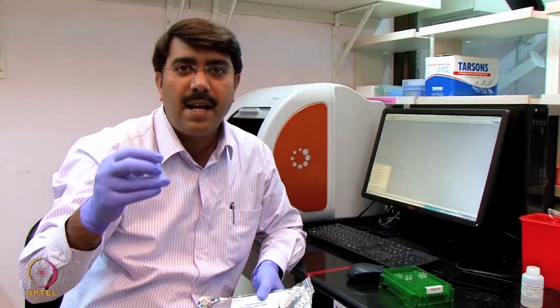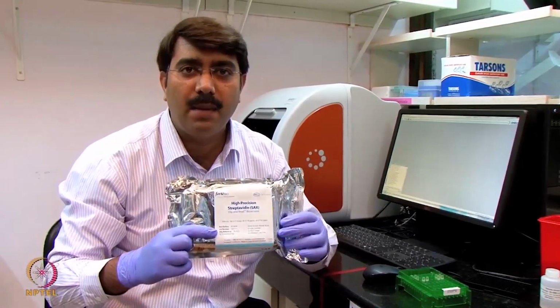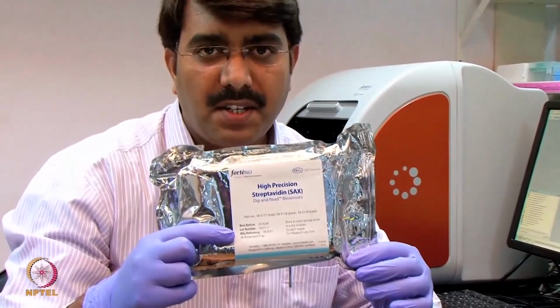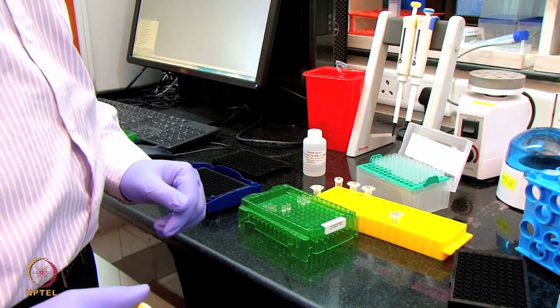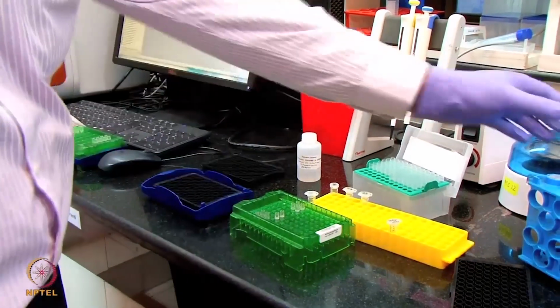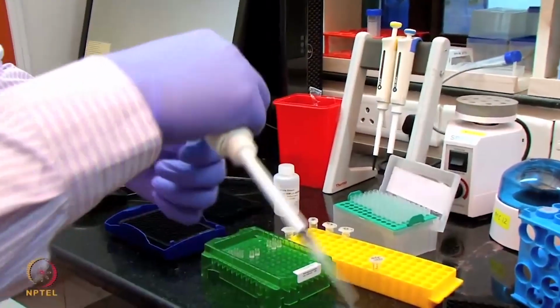I am going to use the biotinylated antibody for immobilization of the antibody onto a streptavidin sensor. This is the streptavidin sensor I am using for the immobilization step. So here in this experiment we are using a streptavidin sensor. The streptavidin sensor has to be hydrated prior to the immobilization. Now I am going to do this hydration of the streptavidin sensors.